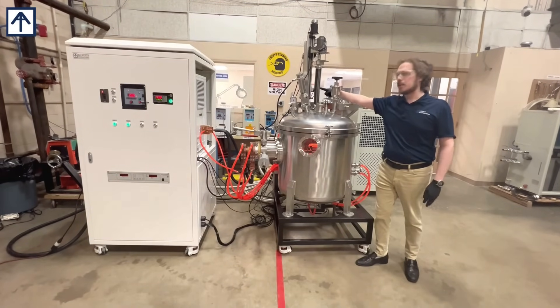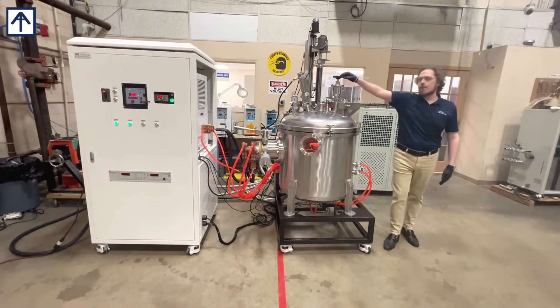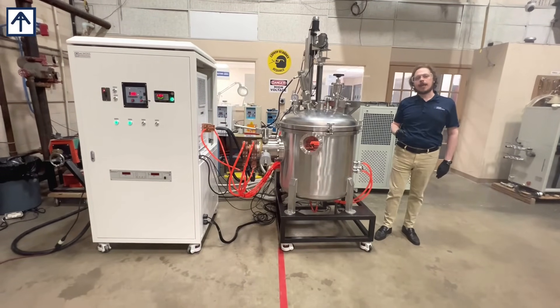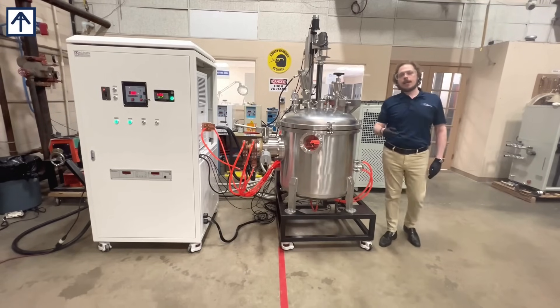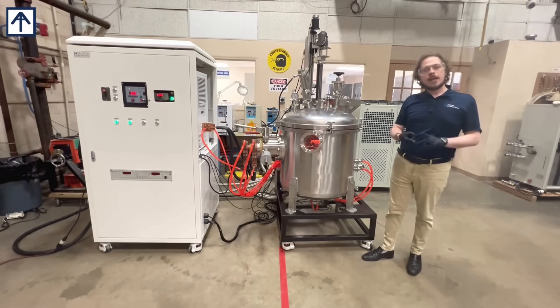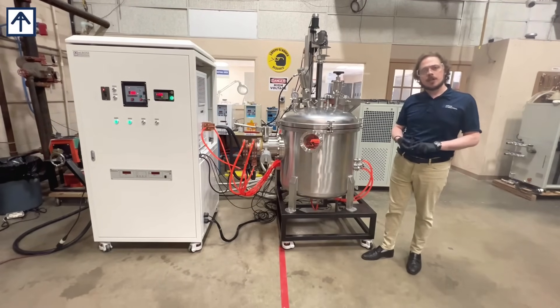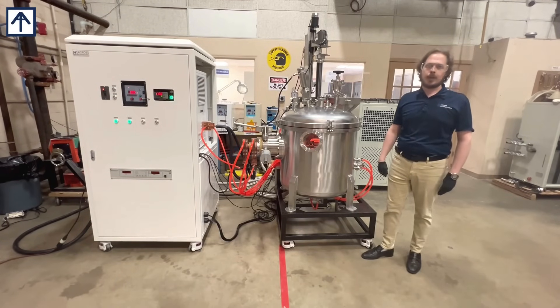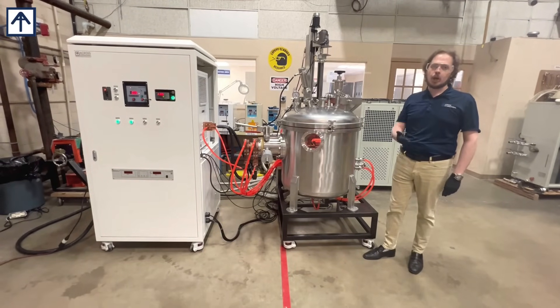It also features overhead stirring, an automatic load and heat, and a high-bore high-vacuum pan fitting in the back so that you may connect either your roughing pump or turbo station for working with nickel or stainless steel alloys, cobalt, rare earth metals, or whatever else you would like to treat under a high vacuum or an inert gas atmosphere.